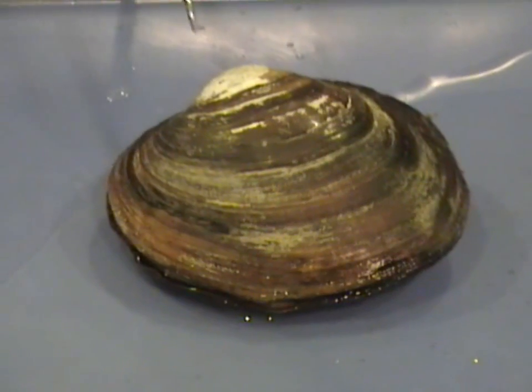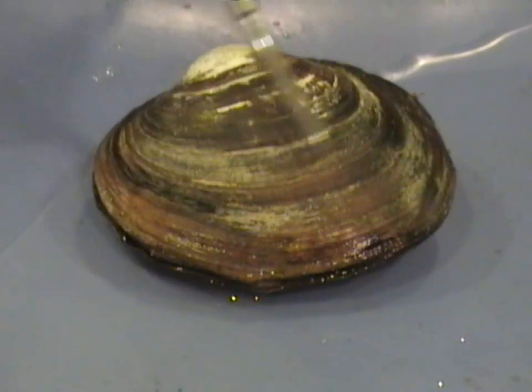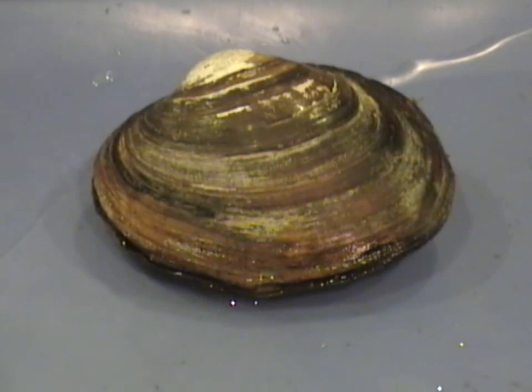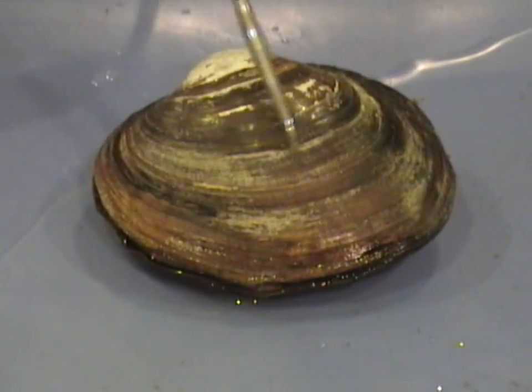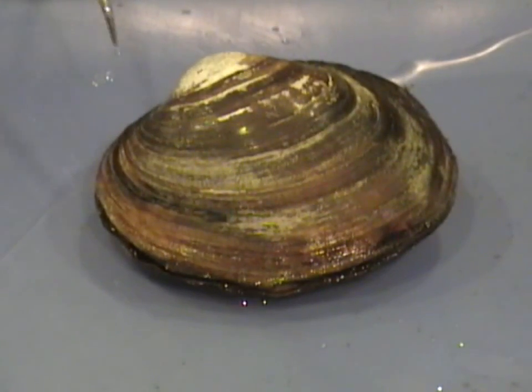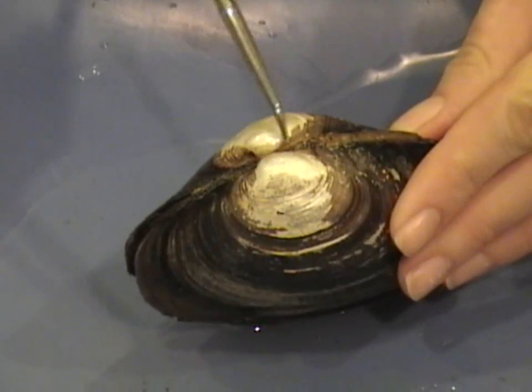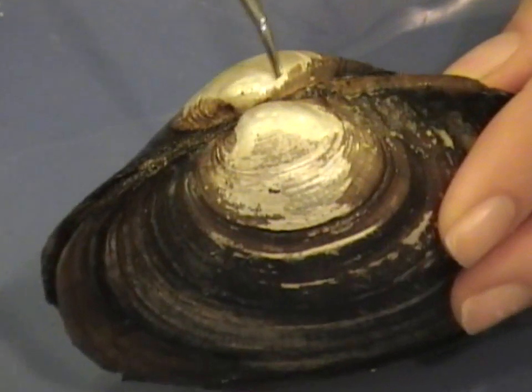We're also going to look at some other key shell features. This outside area is the periostracum. These lines are also known as growth lines. Close to the umbo over here is the outer hinge ligament.